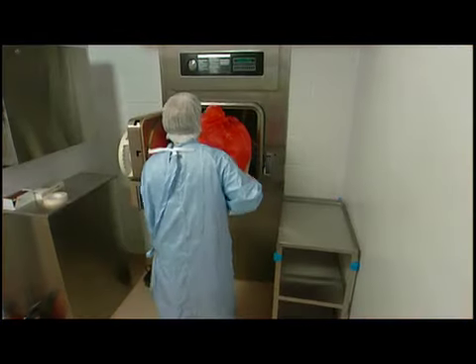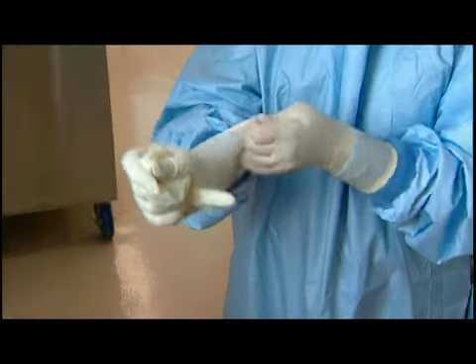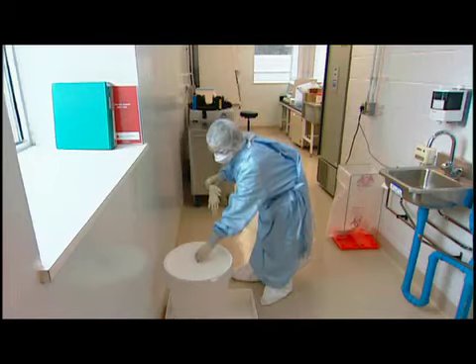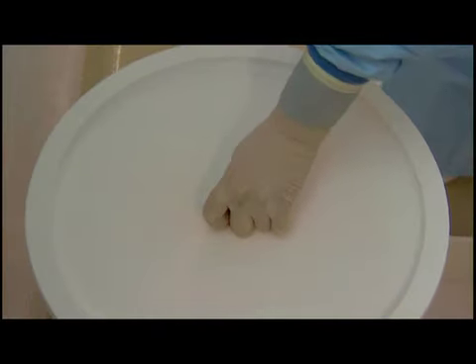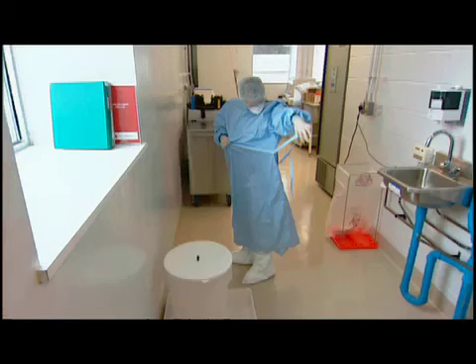The following exiting and doffing procedures are intended to prevent contamination from spreading outside the lab. When removing laboratory clothing, this must be done in a manner that minimizes contamination of skin with potentially contaminated clothing. Before you leave the containment area, make sure that all waste has been properly disposed of. Remove your outer gloves and discard them into the autoclave bag. Remove the protective gown and hang it up if it's to be reused.